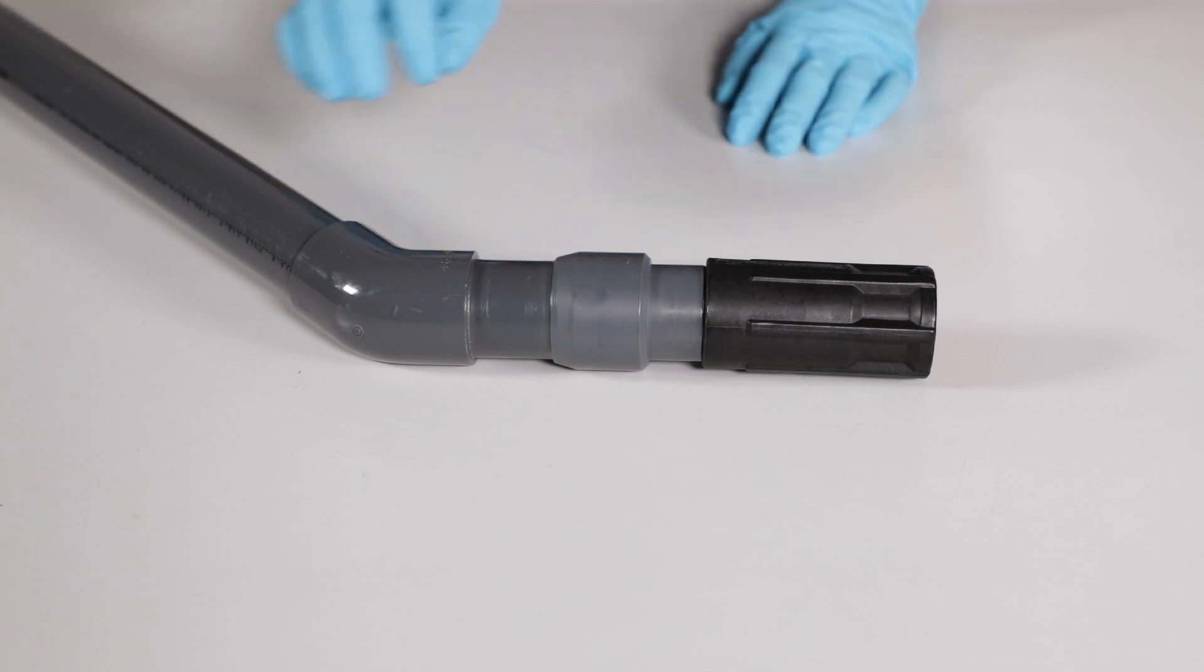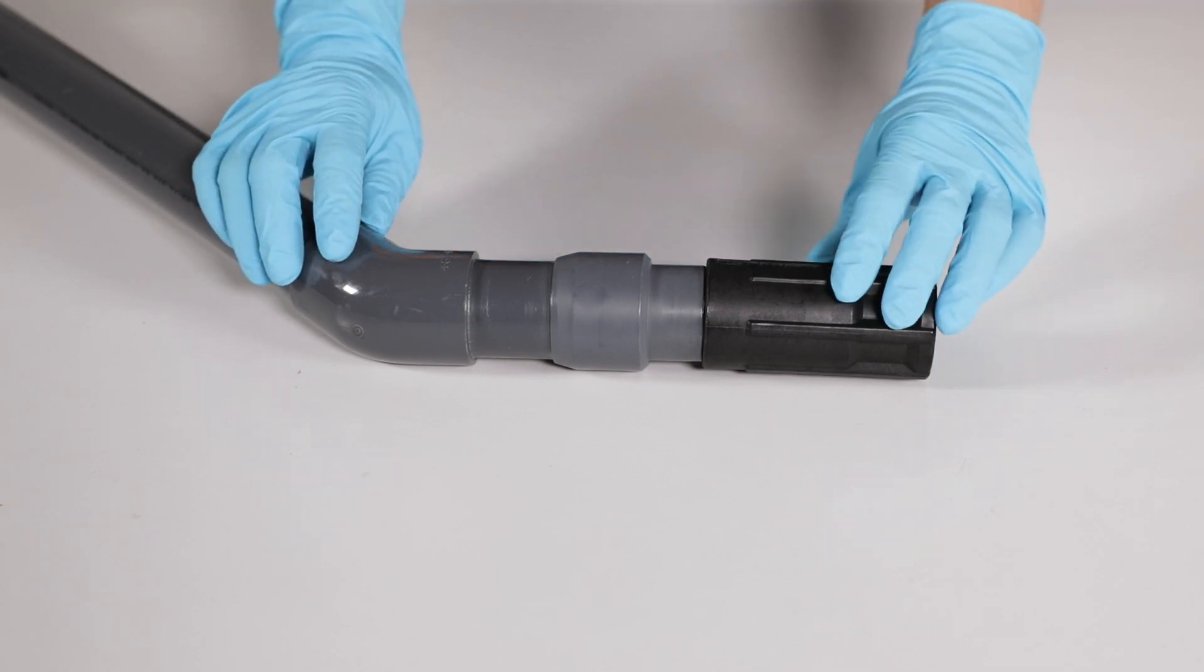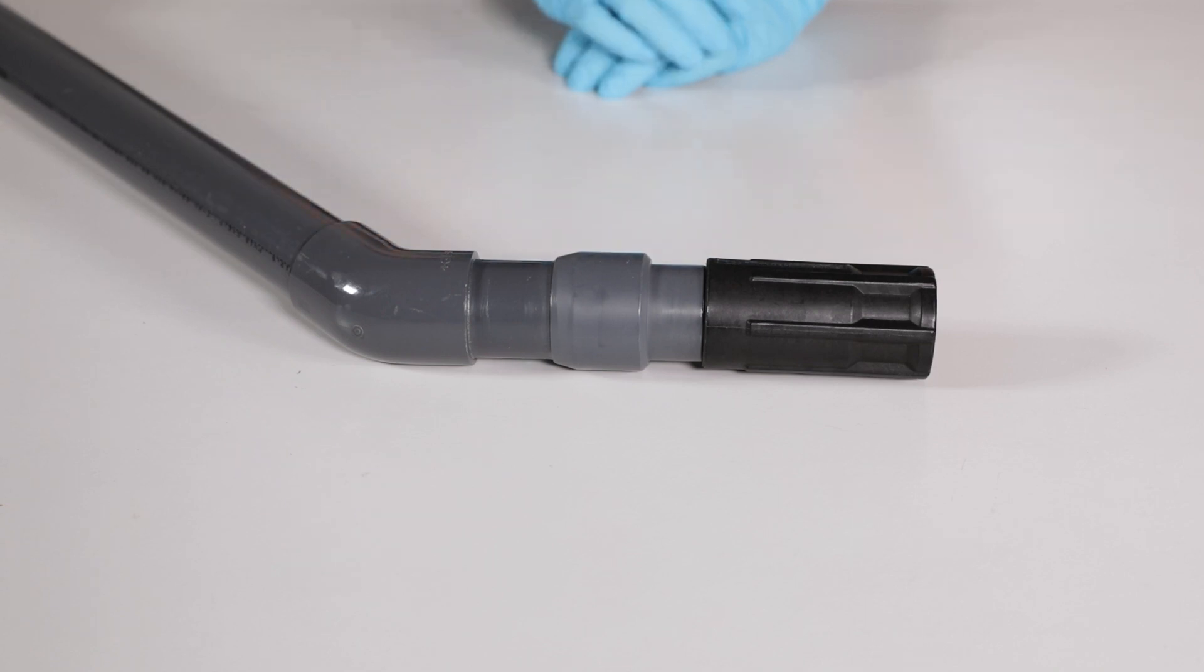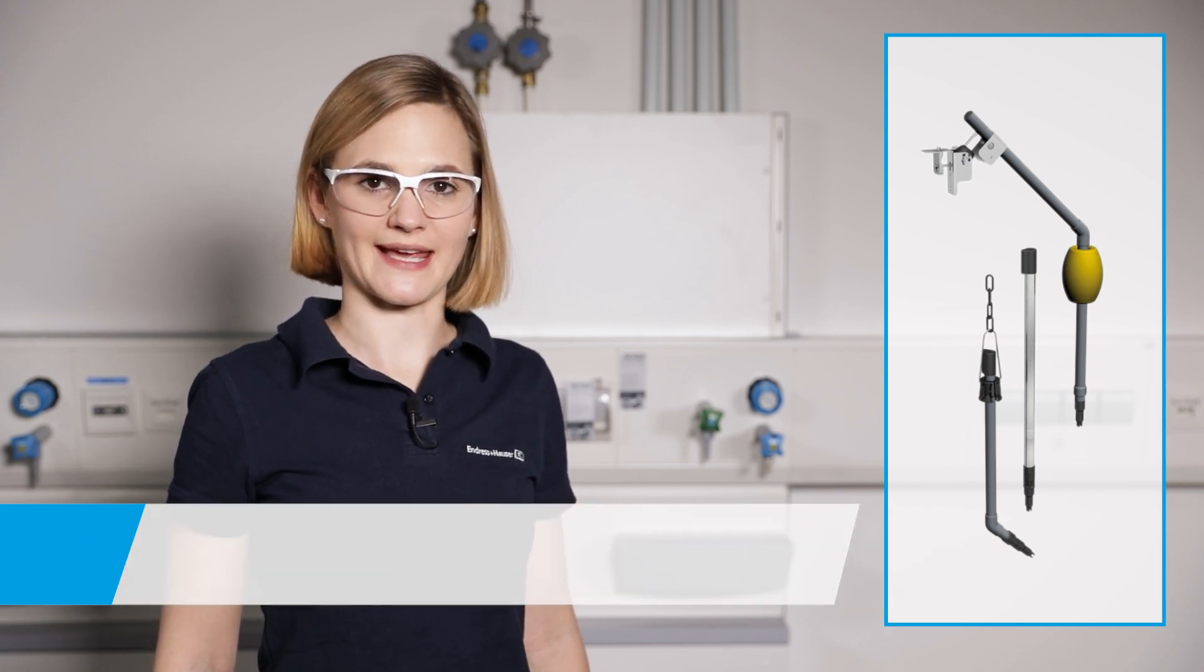For installing the sensor into the CYA112 using the quick fastener is recommended. Installed in this assembly the flow velocity against the membrane must be at least 15 centimeters per second.